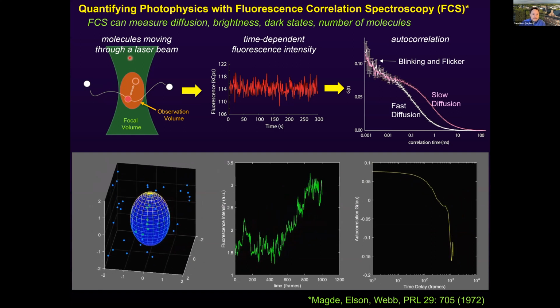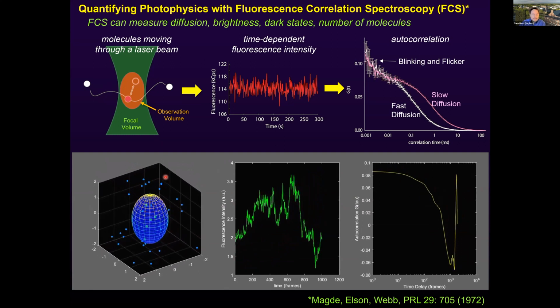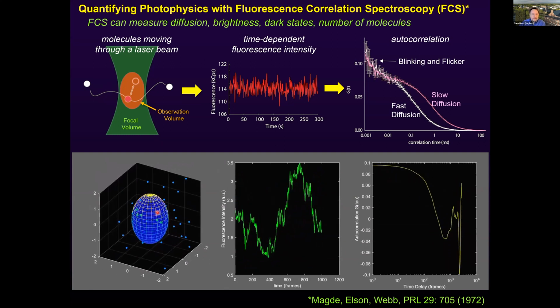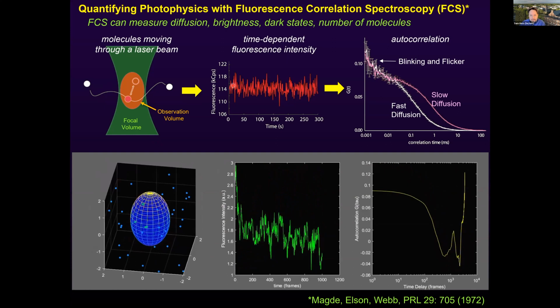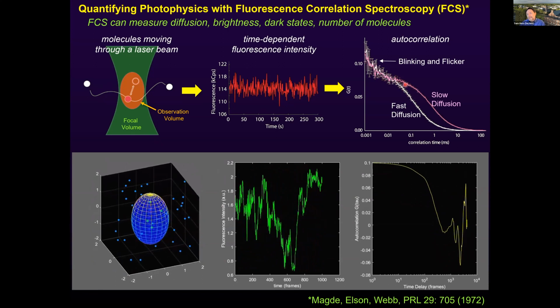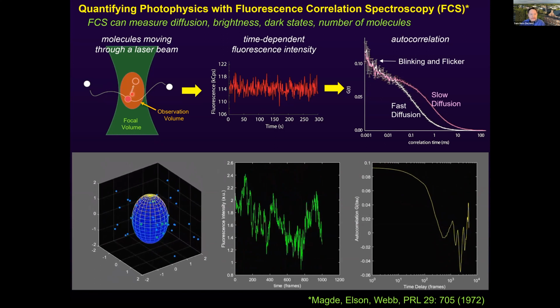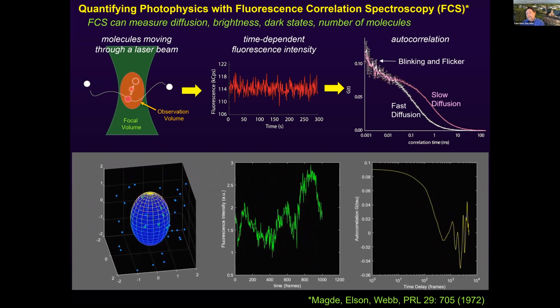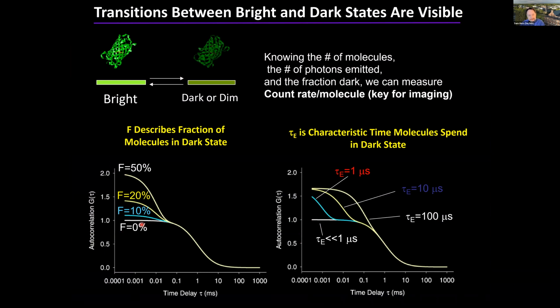We used a technique called FCS, fluorescence correlation spectroscopy, which was invented by my advisor, Watt Webb, where individual molecules diffuse through a diffraction-limited focus. Those molecules enter the volume, causing fluctuations in the fluorescent signal. You can autocorrelate this signal with itself and get a correlation curve, which shows the time of diffusion, the time the molecules spend within the observation volume, and also any transitions between bright and dark states that occur while they're in the volume, which appear in this part of the curve. And this allows quantification of the time molecules spend in a dark state, as well as the fraction that are in the dark state at a given time.